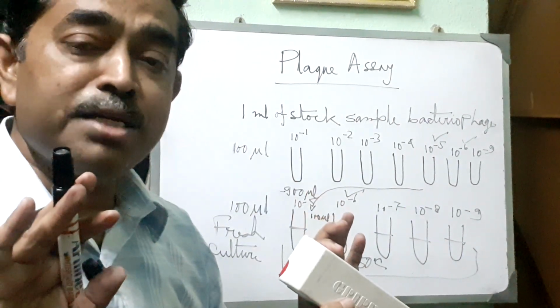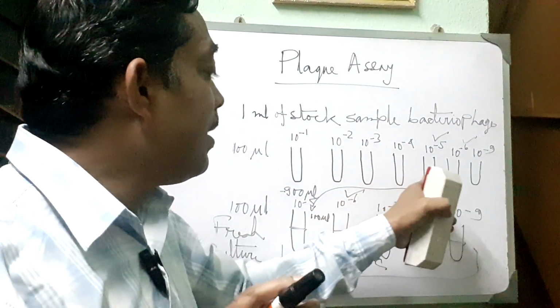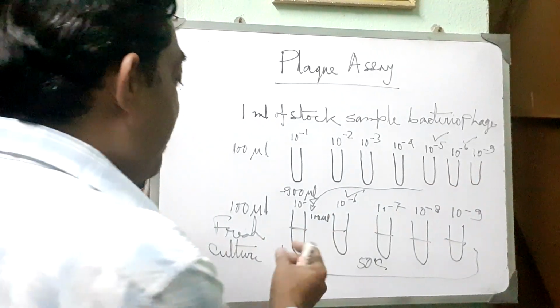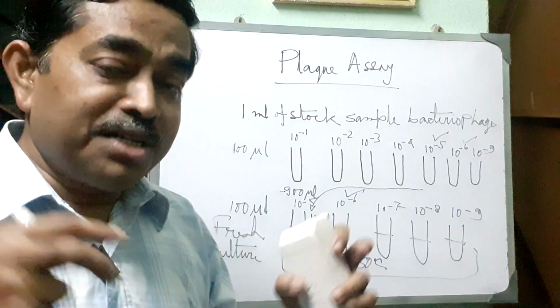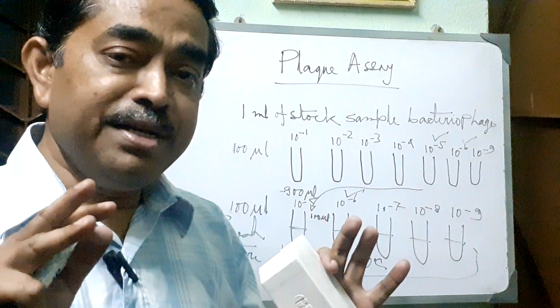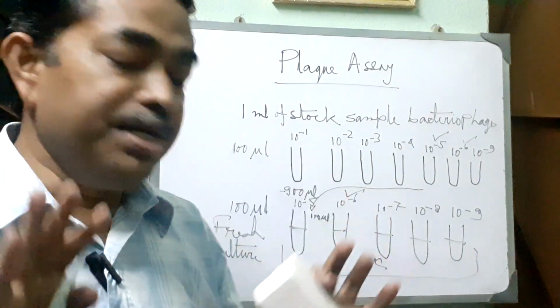Why does it stay for 10 minutes? Because whatever bacteriophage is present here can attach to the starter culture for its lytic cycle. So this time is given for the bacteriophage virus for 10 minutes.